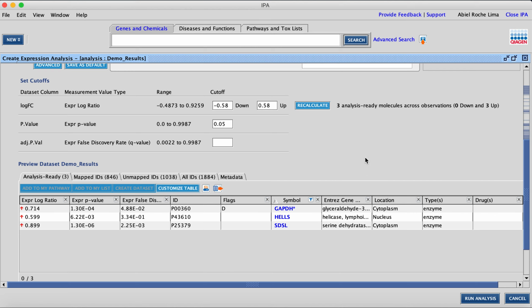And if we are from a biochemistry background, from a more biological background, we can say from the information we already have that these 3 proteins are related in some kind with electron transport chain, Krebs cycle interactions, but since we have IPA to confirm that for us, we can check, for example, if those proteins are already in the functions we are predicting, or in what other functions these proteins are interacting with.